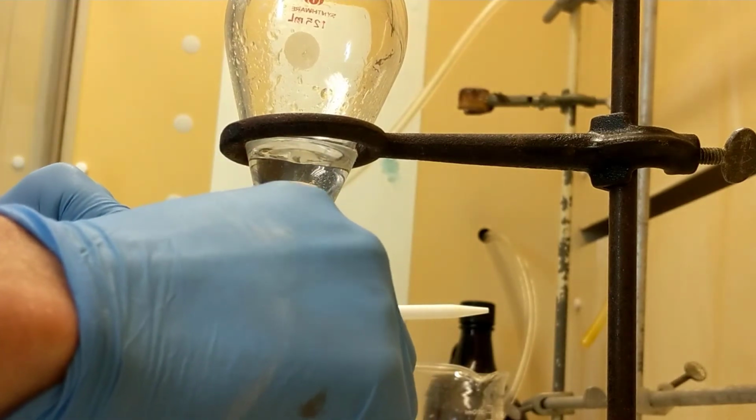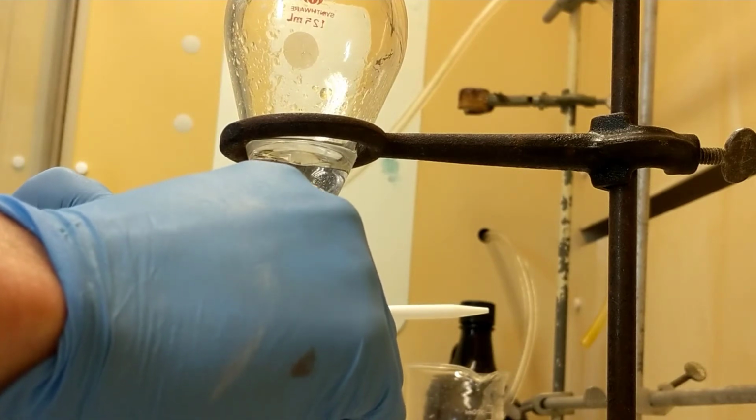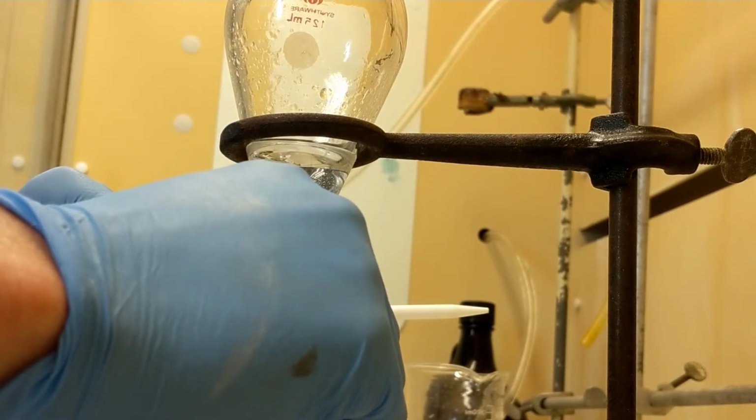You can see the line moving. It's moving, it's moving. I have it at a steady drip right now.